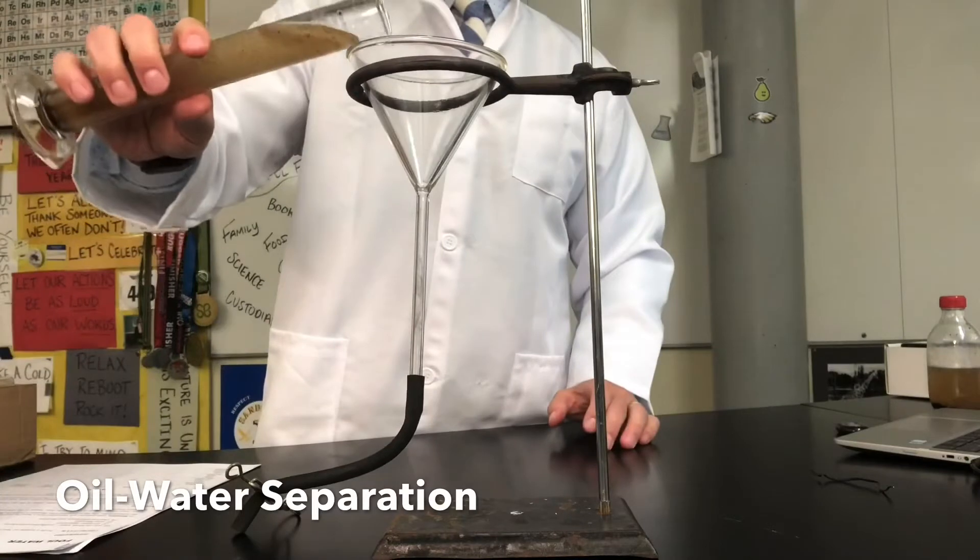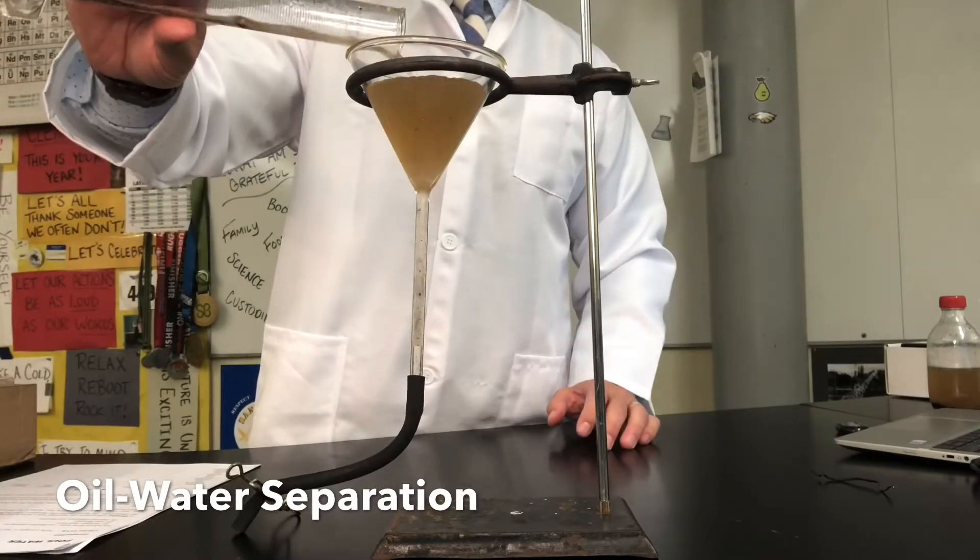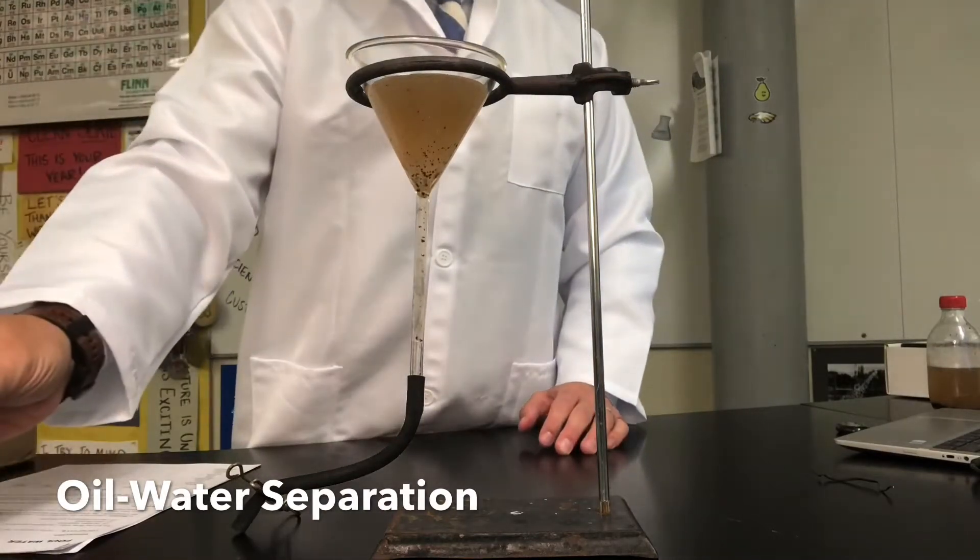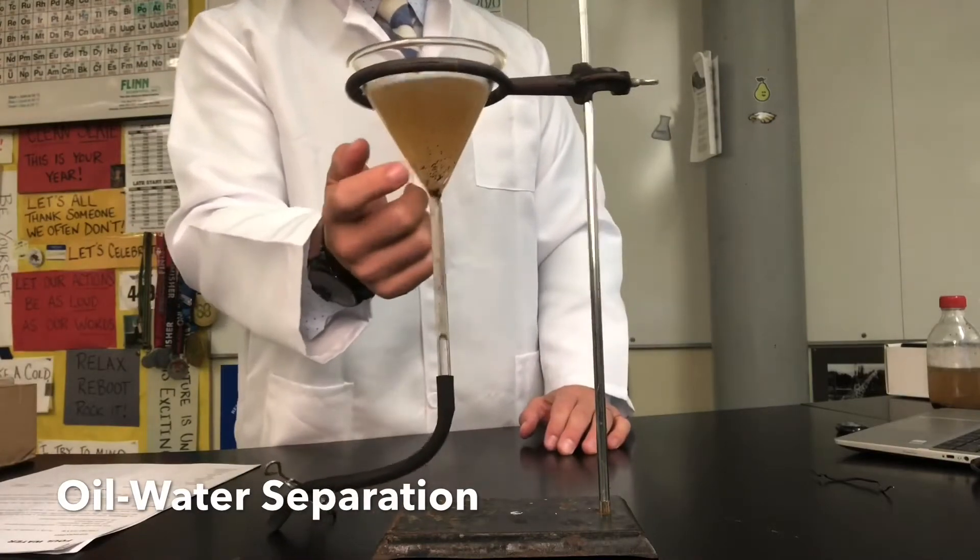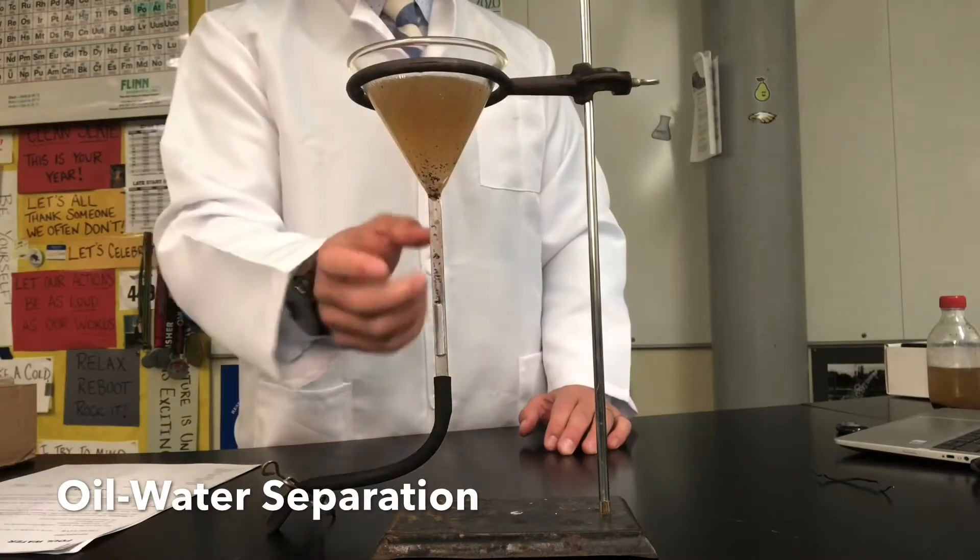I'm then going to take my oil and water sample and I'm going to pour it all the way into this funnel. What I'm then going to do is give it a little bit of time and I'm going to let the oil float to the top as the more dense water sinks to the bottom.